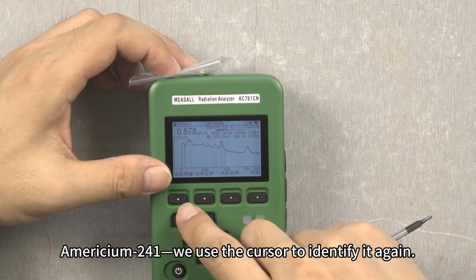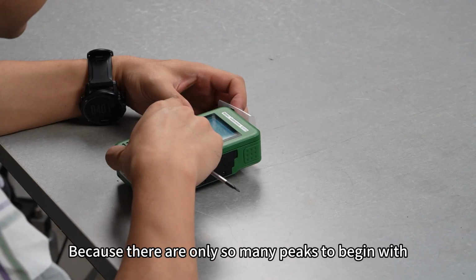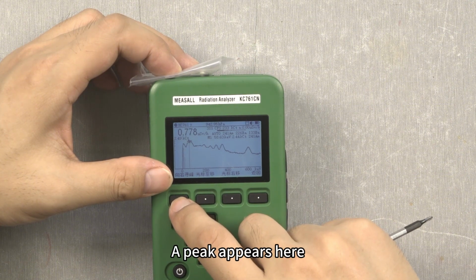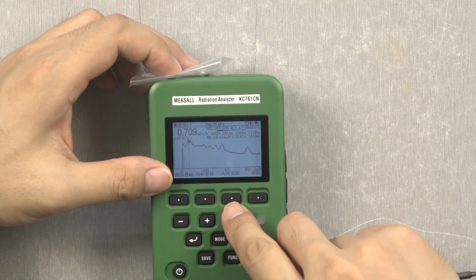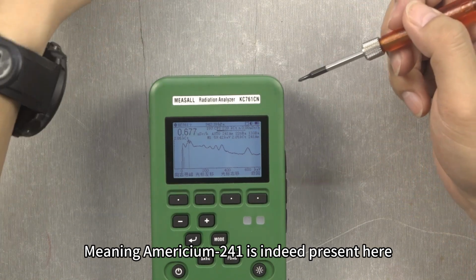Americium-241, we use the cursor to identify it again. Regardless, we can keep searching for peaks to the right. Because there are only so many peaks to begin with, this instrument only searches for peaks to the right. This single button, we just press it repeatedly. Alright. A peak appears here, and the cursor has located it. Here at 59.42 keV, meaning americium-241 is indeed present here.